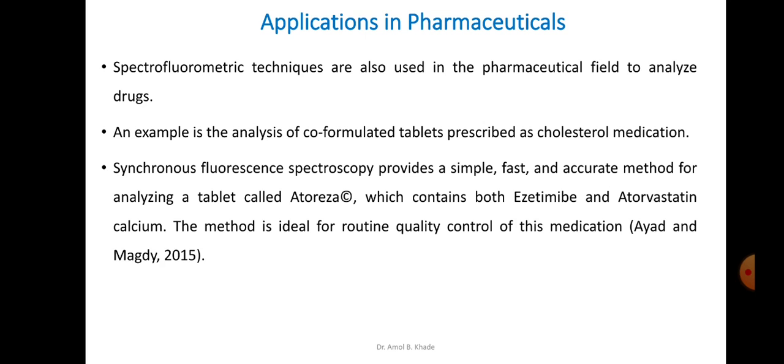So this spectrofluorimetric technique is also used widely in pharmaceuticals to analyze mainly the drugs present in them. An example is the analysis of a co-formulated tablet prescribed as cholesterol medication. Synchronous fluorescence spectroscopy usually provides a simple, very fast and accurate method for analyzing a tablet called Atoriza.